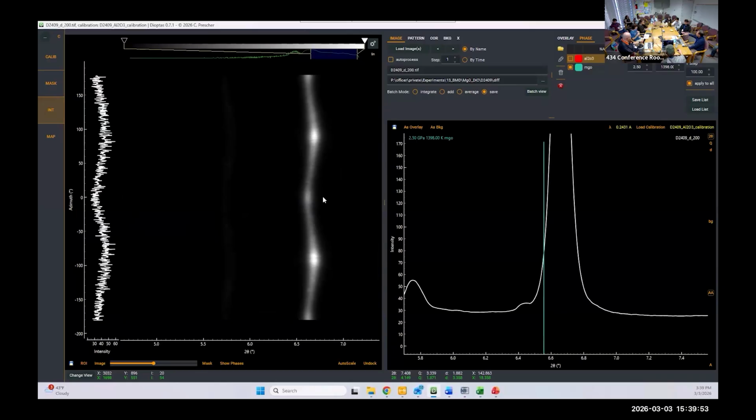Can you also manipulate the energy for those peaks within it? If the peak is not at the place I want, then I change the energy, estimate where it goes, and look at it again.